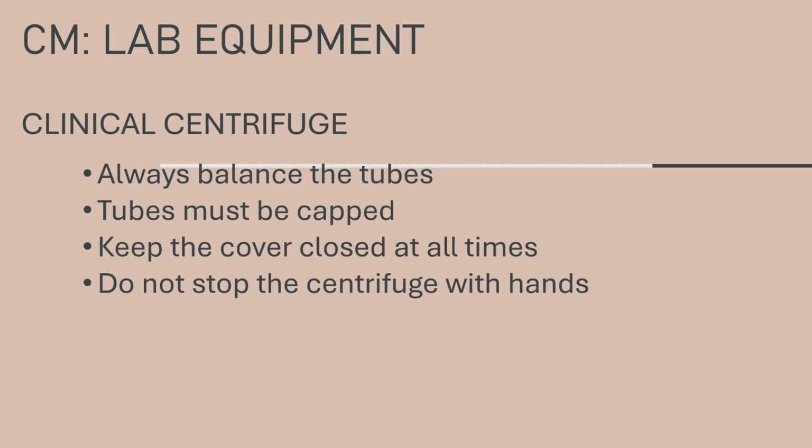Perform periodic lubrication and maintenance of your centrifuge. Again, every 3 months, you calibrate your speed or your revolutions per minute using your strobe tachometer or your photoelectric tachometer. And once a year, you do your preventive maintenance by a professional.